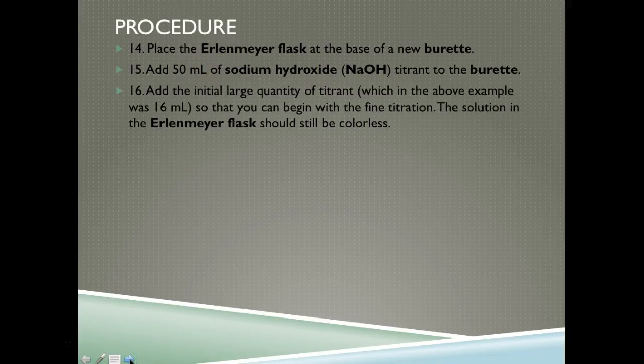So you're going to run another trial, all right? You can't just take one trial and expect that that's it, right? In real life, you want to make sure you have reproducible results, which is why it's recommended that whenever you're doing an experiment, you make sure that your data is reliable by doing it at least 3 times, 3 trials, so that you know that the numbers that you're getting are valid, okay?